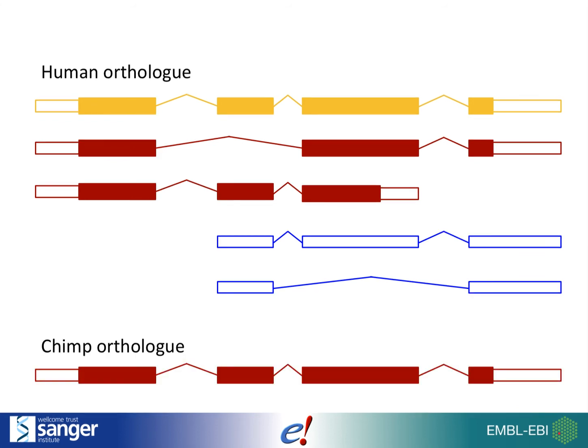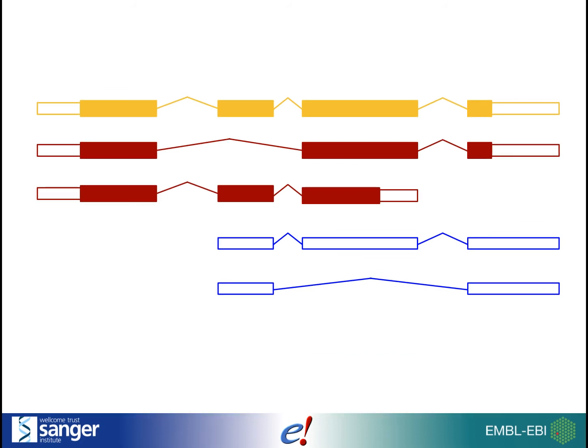Many transcripts may exist in nature that science doesn't know about yet. Species which have not been as extensively studied will not have as many known transcripts as others. On top of the genes, we plot other kinds of data. Variation between individuals, which all comes from biological data, is plotted onto the genome.